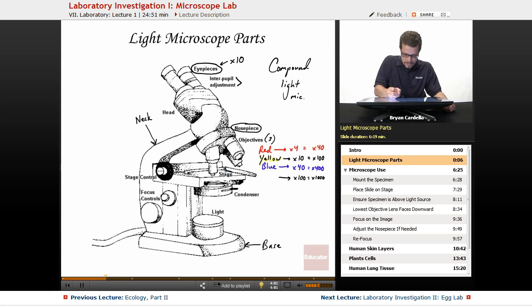A stage. This is where the actual specimen is mounted. Usually there are stage clips, little metal parts that keep the glass slide on the stage. When you rotate some of these focus controls, the stage moves up and down, and that allows you to focus the image. The stage control here moves the slide in a horizontal sense on top of the stage, so that you can make sure that the precise part of the specimen you want to look at is right above the light source. Usually in the stage in the middle, there is a hole that allows the light, when it's turned on, to go up through the condenser and into the hole in the stage. That's why it's a light microscope.